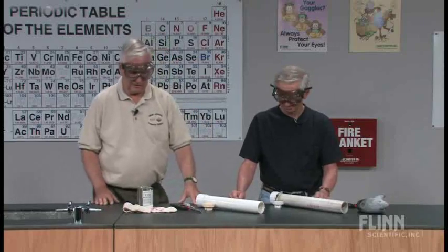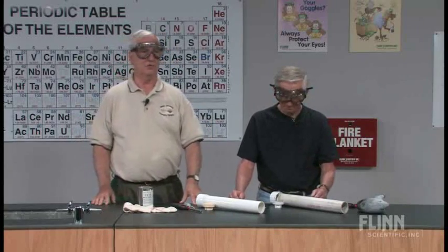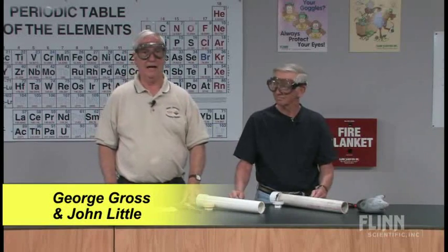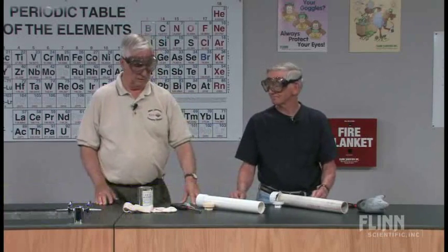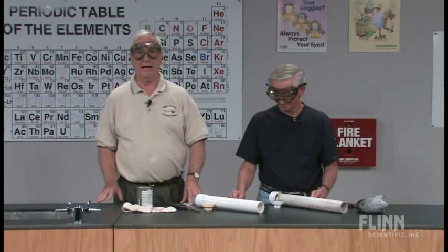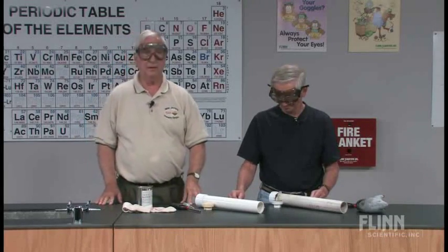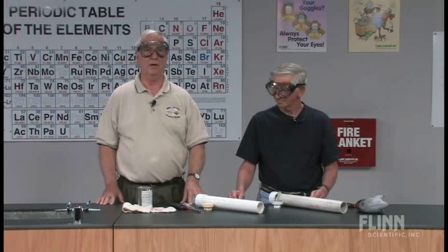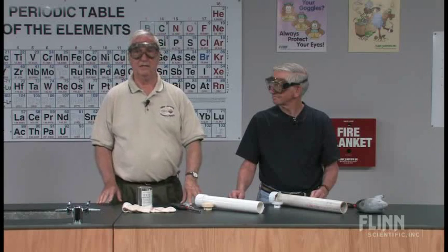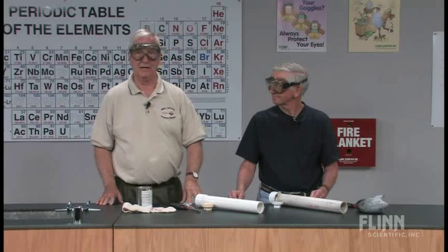John and I are now going to demonstrate a basic combustion reaction — the basic combustion of acetylene gas. We will demonstrate first how to build an acetylene cannon. We will then take the calcium carbide, react it with water producing the acetylene gas, and ignite it to produce the combustion reaction.